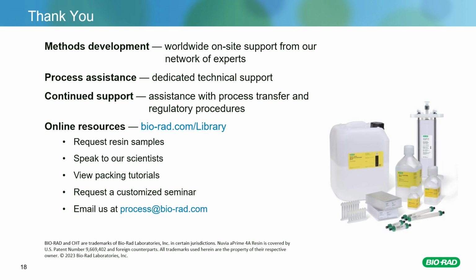Selecting appropriate factors to test is more important than selection of the best DOE design at this stage. For example, if you select to test and control only pH and forget about conductivity, it might turn out that the results will be misleading because there is no visibility of how conductivity will influence the process.